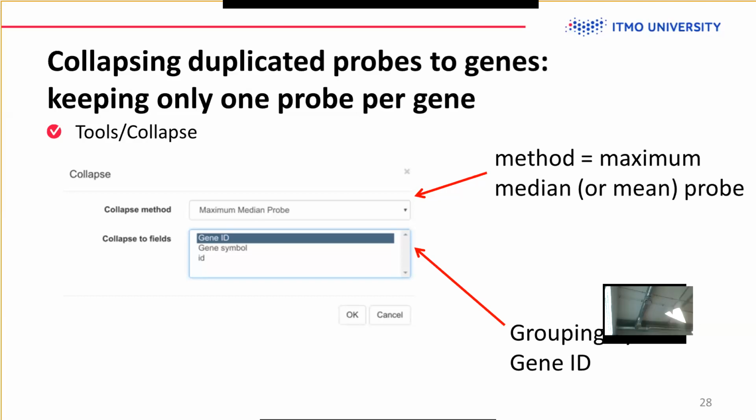With gene expression, which has become a very common tool in biological research, basically if you don't know what to do, just do RNA sequencing or microarray, and it will tell you some gene expression changes. In this case, you usually want to look at genes, and in particular protein coding genes, because you have about 20,000 protein coding genes, and there are like 40K other genes on top, which are non-coding or whatever, or maybe not genes at all.